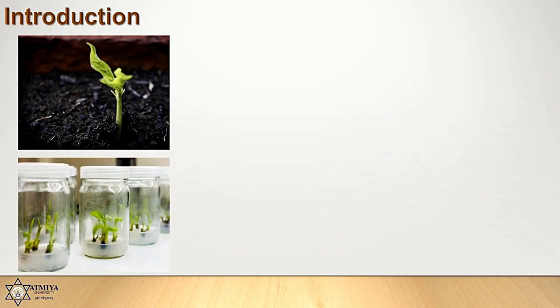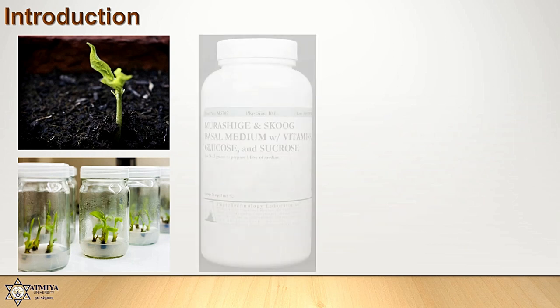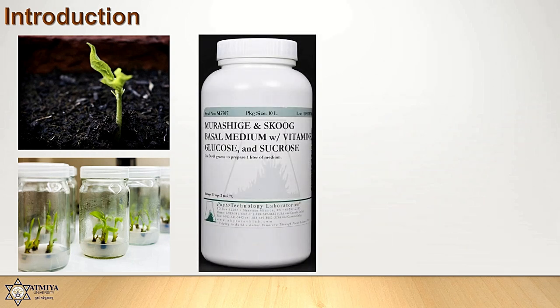plants through media. In the theory section, you have already learned about the various types of plant tissue culture growth medium which is used to culture in vitro plants. You have also studied about the purposes served by different culture mediums, and how to select the right media for your plant in just 5 steps. You must know, of all the media, the Murashige and Skoog (MS) medium is one of the most extensively used in plant tissue culture labs worldwide.